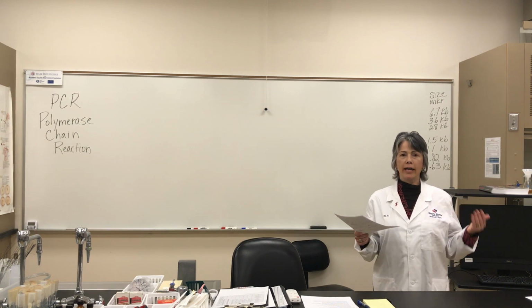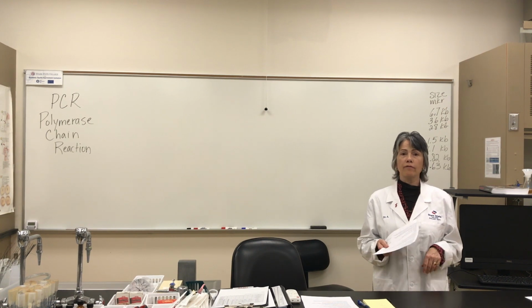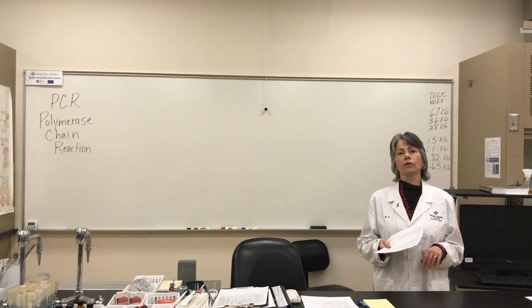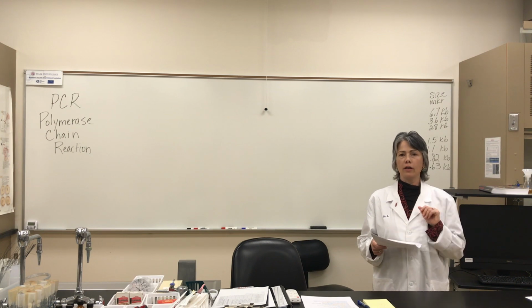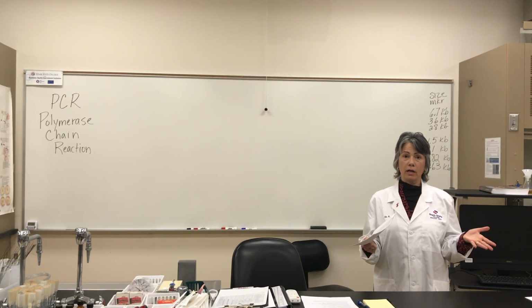Both PCR and ELISA are used nowadays for testing for infectious diseases. So these topics are particularly relevant in today's world. So PCR, if you hear that they are doing DNA testing for an infectious disease, they're doing PCR.